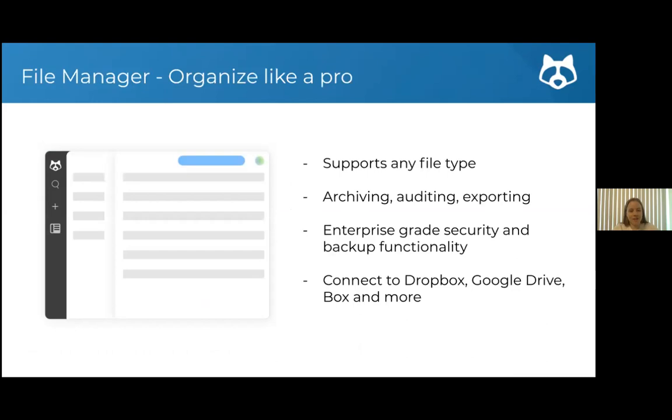And then our file manager. The file manager really is where everything happens. If you are creating protocols, or if somebody shared a protocol with you, you'll see it in your file manager. And the great thing about the file manager is it does support any other file type. So if you're looking to share any spreadsheets or PDFs or presentations or whatever it might be, if you want to share that with others or keep it for yourself, you can add other file types in there as well.